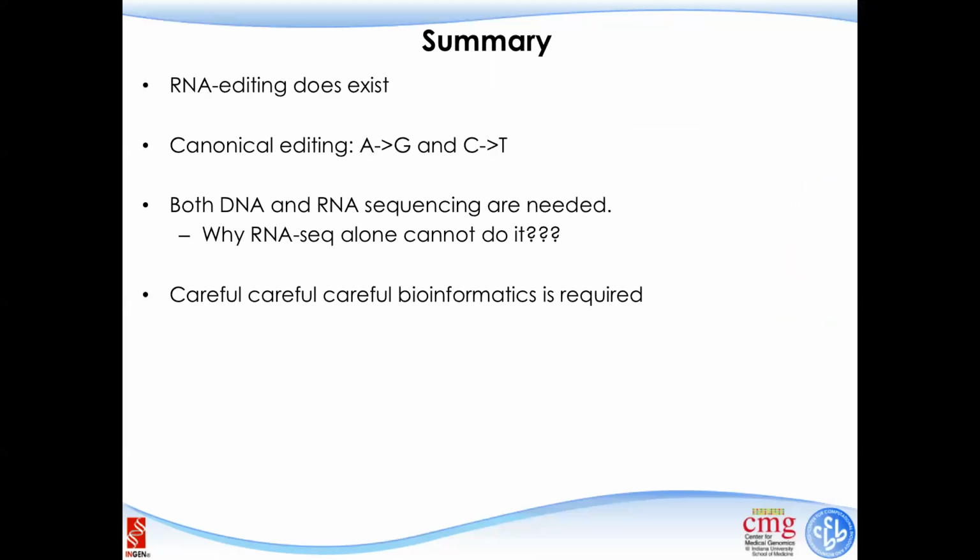But you may really need careful validation, because it can be caused by false discoveries or false mappings, or because you do it in tissue, the genome you have may be biased, since you just get a tissue-level genome.